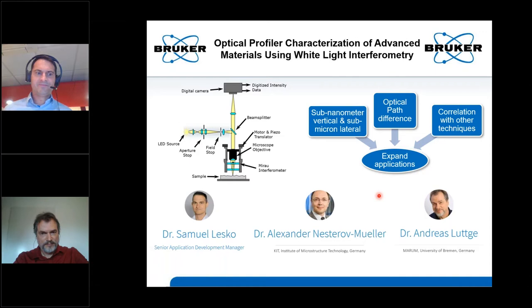So I'd like to thank you for attending this technical webinar that will concern white light interferometry profilers, used not only to measure topography, but thanks to its core benefits of vertical and lateral resolutions, we want to use it to characterize advanced materials using optical path difference or correlations with other techniques.